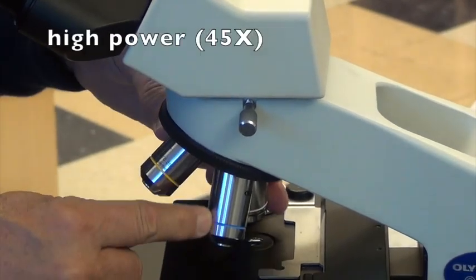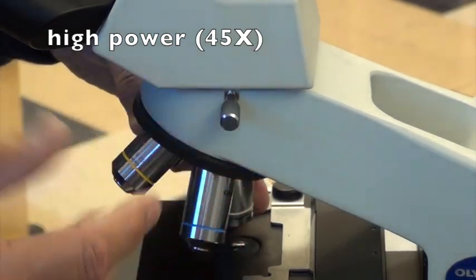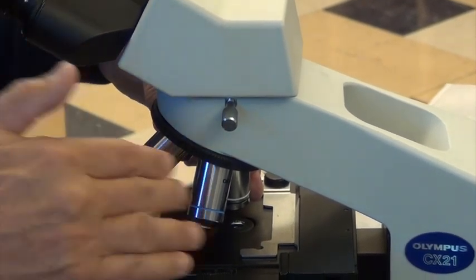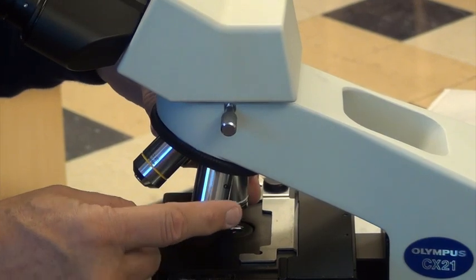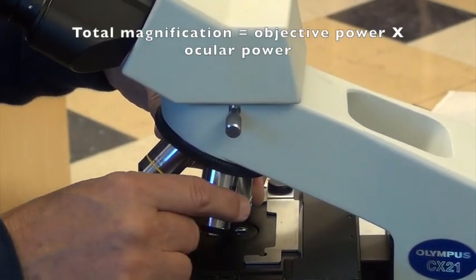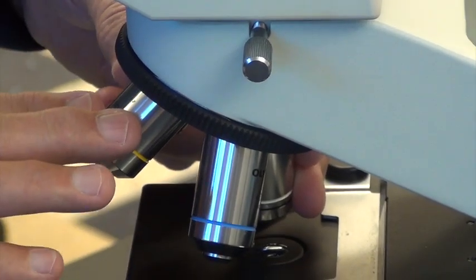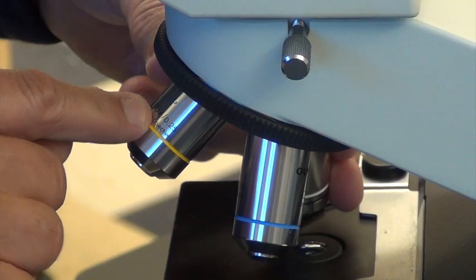Next in line is the high power objective, which is generally 40 or 45x. By that I mean times whatever the oculars are, which is 10. So in general, your total magnification is arrived at by multiplying the objective. You can see what the power is written on each of these — if you forget, just get down really close to the microscope and engraved in the objective it will tell you its magnification.